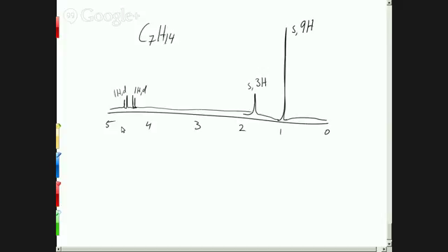Yeah, like a chicken feet kind of thing. We can look at the model of that too. Here. Since we know CH3 is a pretty common group, it's a reasonable guess to say, well, if it's 9, that's probably 3 CH3s, right? If it were a group of 6, we could say, well, that's probably either 2 CH3s or 3 CH2s, because those are common. Again, there's some trial and error here. So we can make some guesses and then check our guesses and see if they make sense or not.